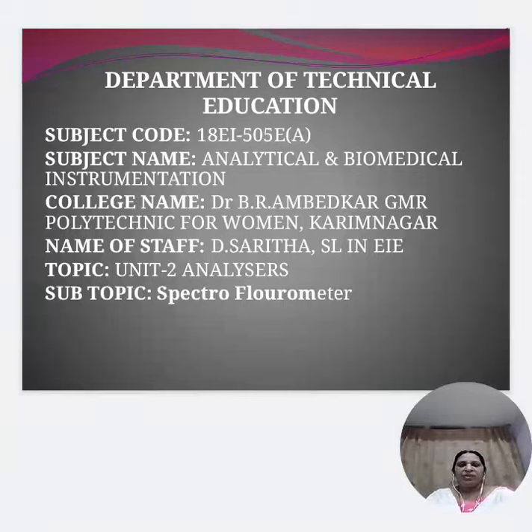Today I am going to deal with the topic Spectrofluorometer.